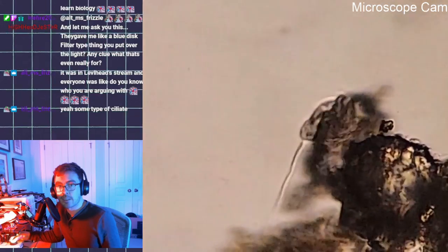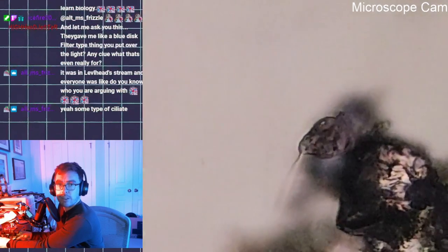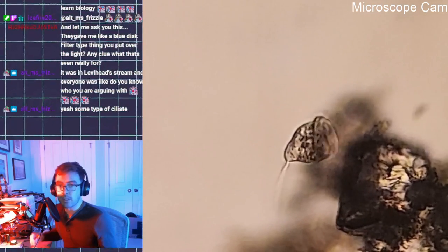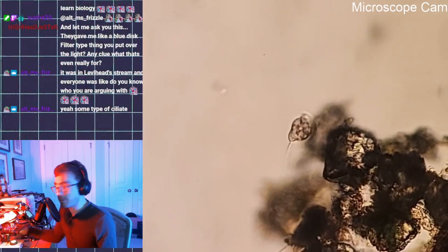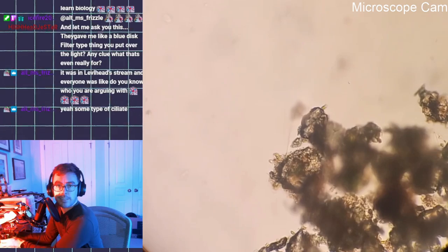So I have a filter right here. It also might be a polarized filter. Certain things look better under polarized light. So right here is my polarized light filter. Let me just go back. I've never found a real use for polarized light, but certain things do require a polarized light filter. Different color filters just help certain things pop, and you can get them in a whole range of colors. I don't find them particularly useful, but my day-to-day science is not microscopy, so I'm sure there's some much better application for them than I ever used them for. Definitely keep them around. Keep that in your toolkit. Who knows when you might need it.